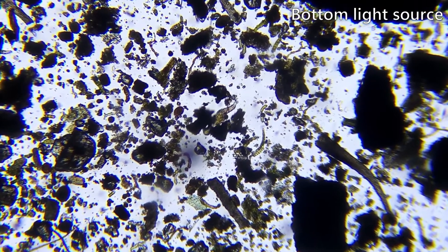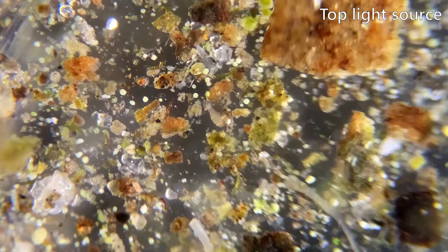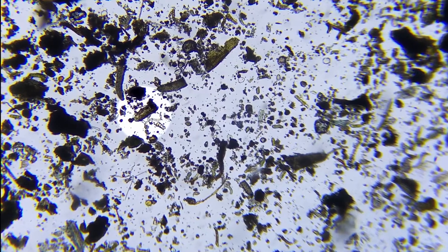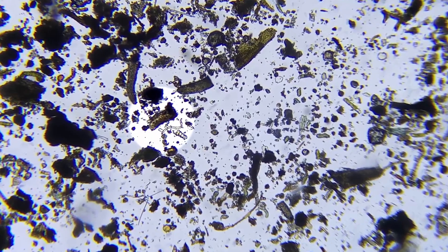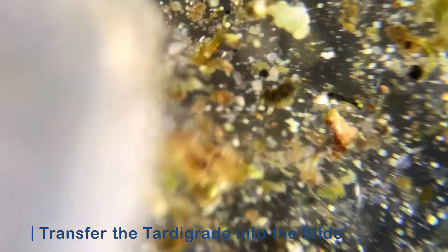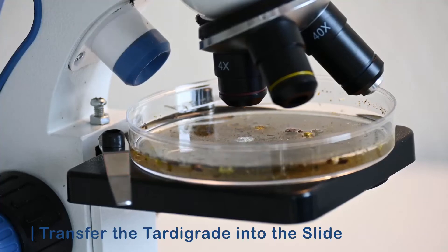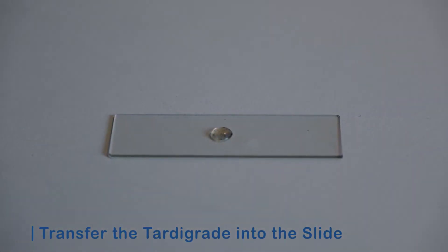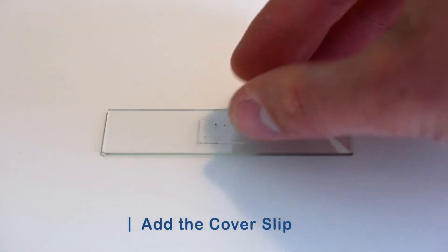This one is another tiny animal called a rotifer, but we are hunting for tardigrades. There we have one. The next step requires a steady hand. If we want to have a closer look at the little fellow, we need to transfer it to a blank slide using the pipette. Add the drop with the tardigrade to the glass slide and place a cover slip on top.